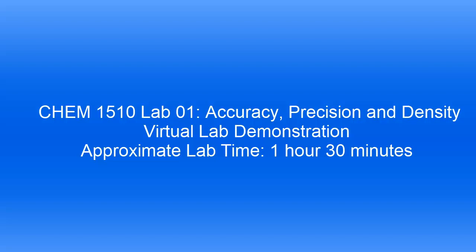Hello everyone. Welcome to the first lab of General Chemistry 1, where you'll be pipetting water using three different pieces of glassware.